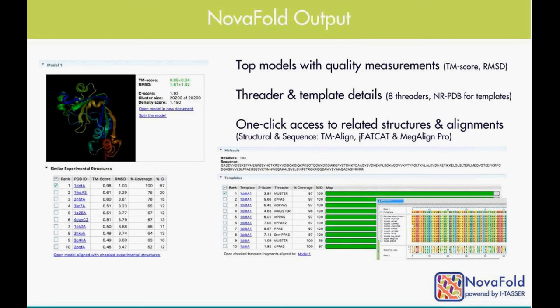templates. Once the prediction is done, you probably want to take a look at structural alignments against the templates that were used. And it even provides you with a list of related proteins that you can do structural alignments with. And then also you can take advantage of the whole suite of applications within LaserGene in that you can do direct sequence alignments to related proteins or the templates that were used against your protein of interest, and that's highlighted in the lower right.